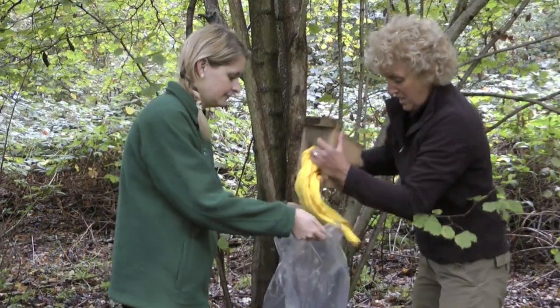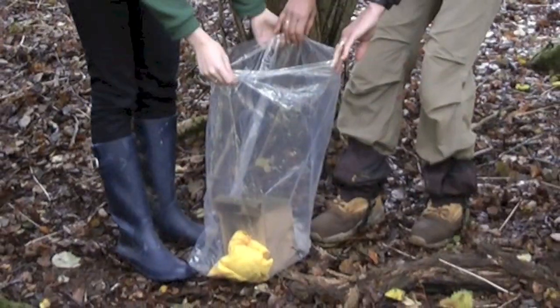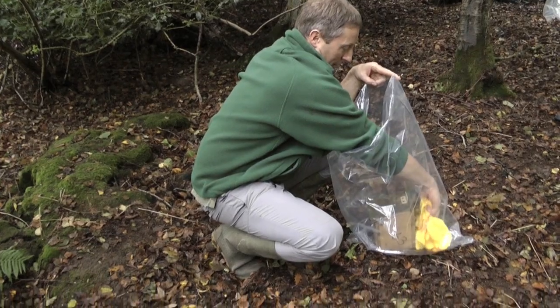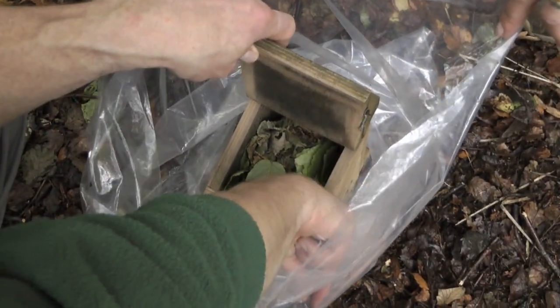A nest has been seen in a box, so it has been taken off the tree and placed in a large plastic bag. Sleeves are rolled up, the lid and bung taken out of the bag as normal, and the corners of the box are checked.